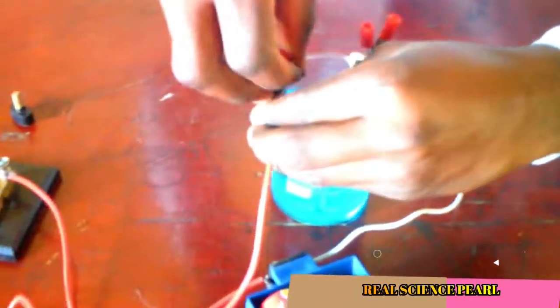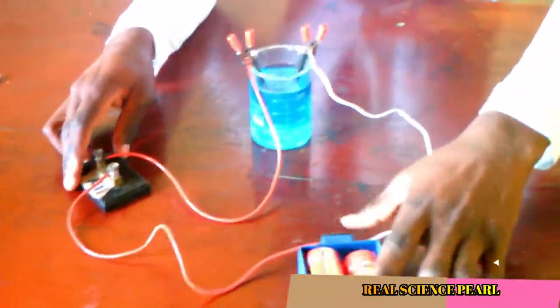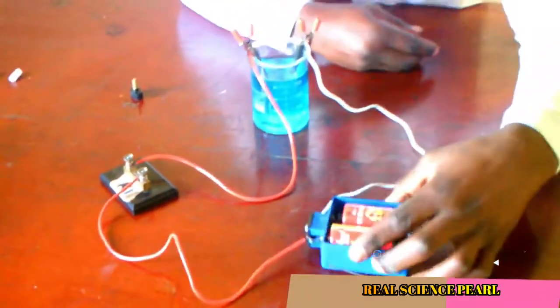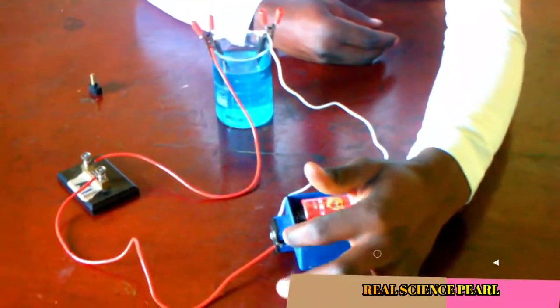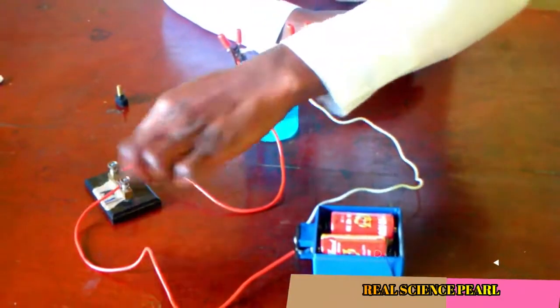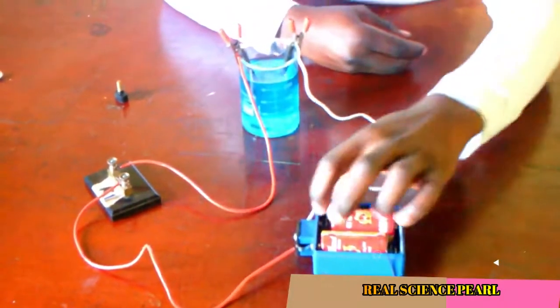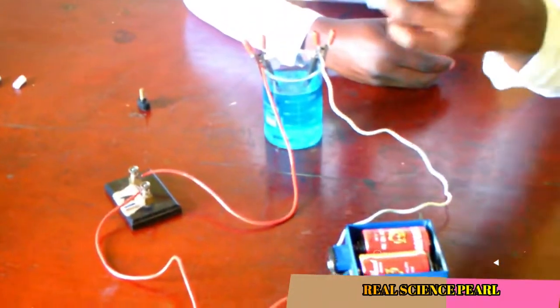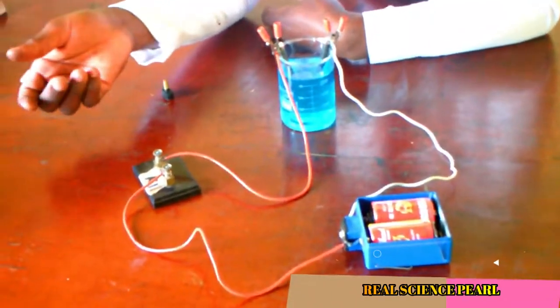Then I connect also another one. Then I'm going to tell you which one is the anode and which one is the cathode. So here with me now, I've already dipped them. Now the dry cells, this is my switch and the dry cells are here. So I want to show you that this is the positive terminal. So it's going to the switch, then it means this electrode here is what we call the anode. So now that this is the negative, it will go and make connection to the cathode.